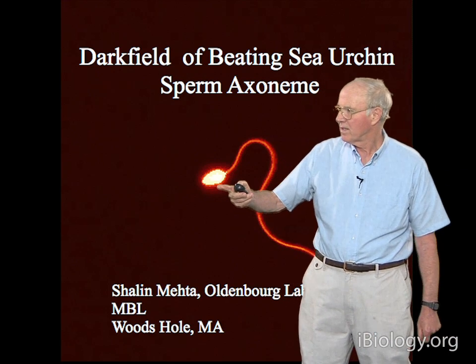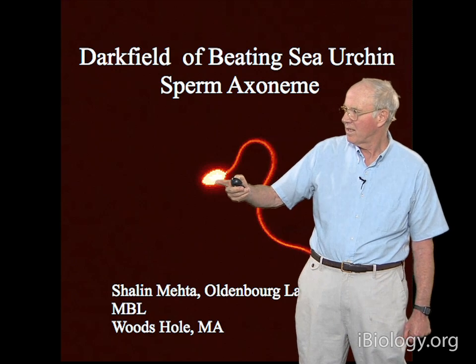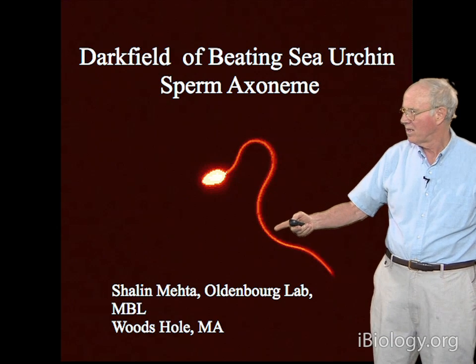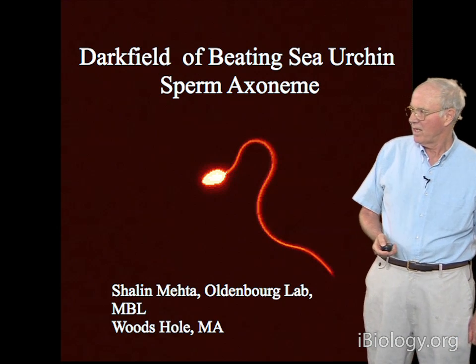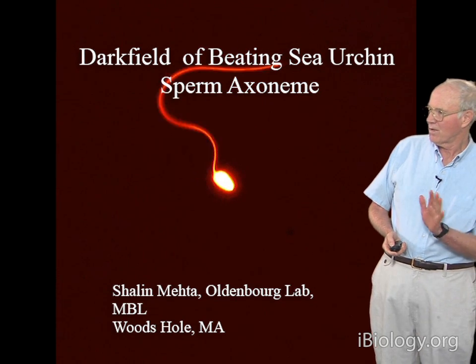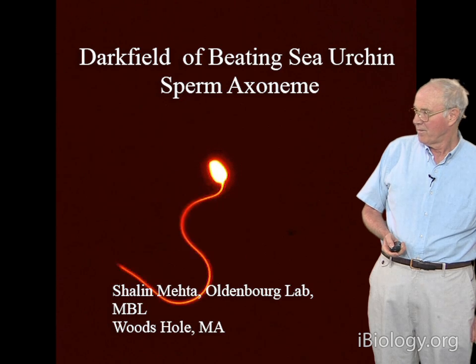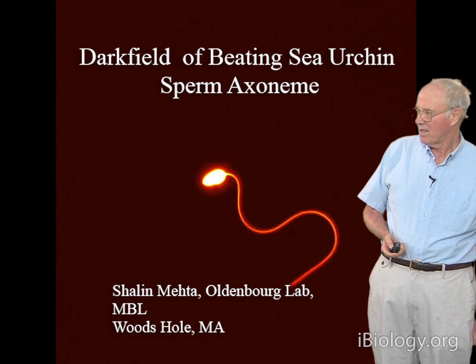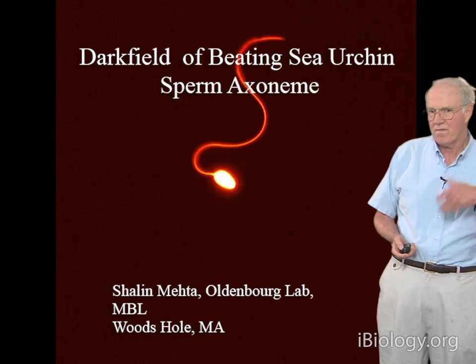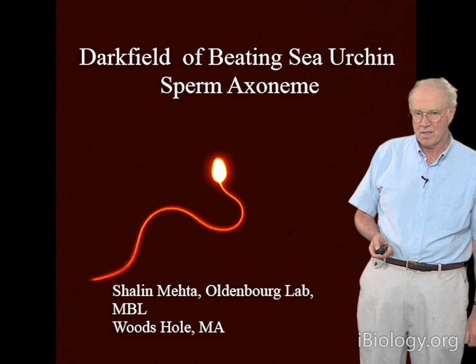This is the head of the sperm with a compacted chromatin and DNA, and this is the long flagella here, which is about 250 nanometers in diameter. And this shows you very nicely in dark field, which is slightly pseudocolored in this image here, the beating of the flagella that's been slowed down in real time. I think they beat at about 30 hertz, so it's quite fast. So this has been slowed down, but it's very, very clearly seen in dark field microscopy.